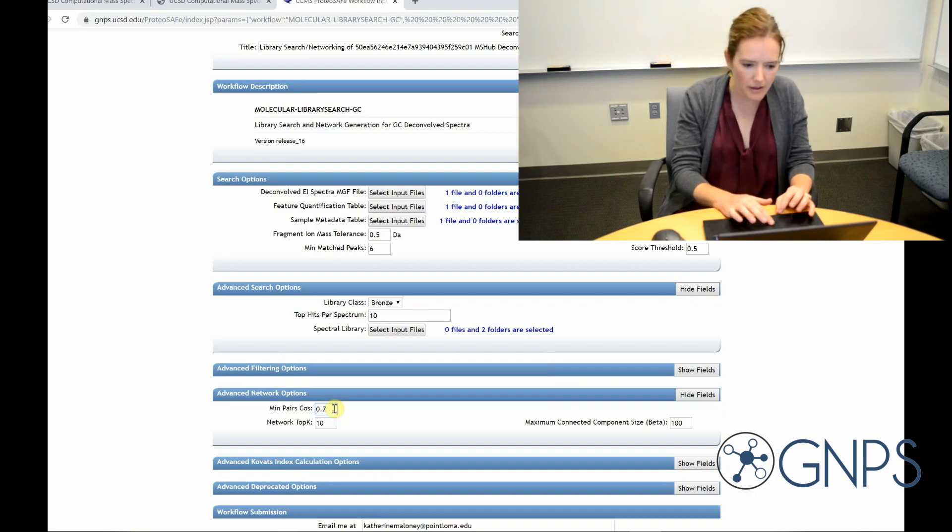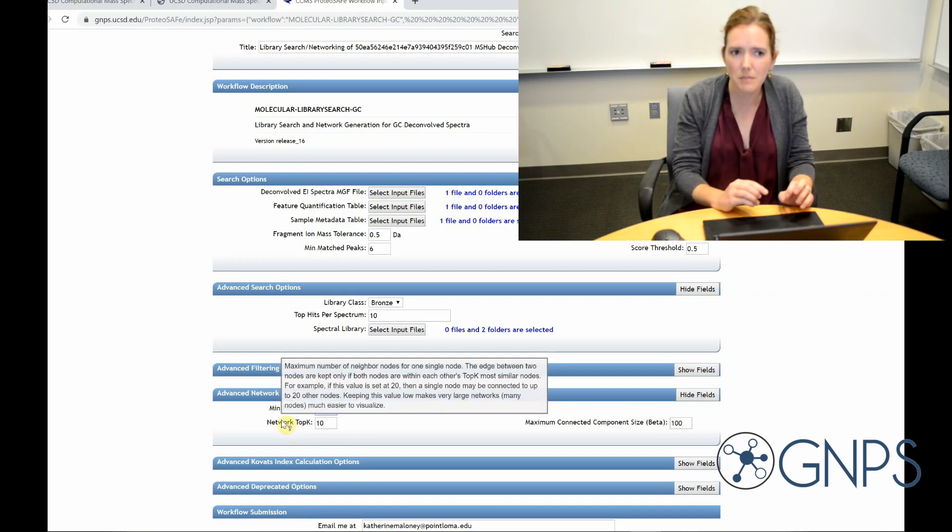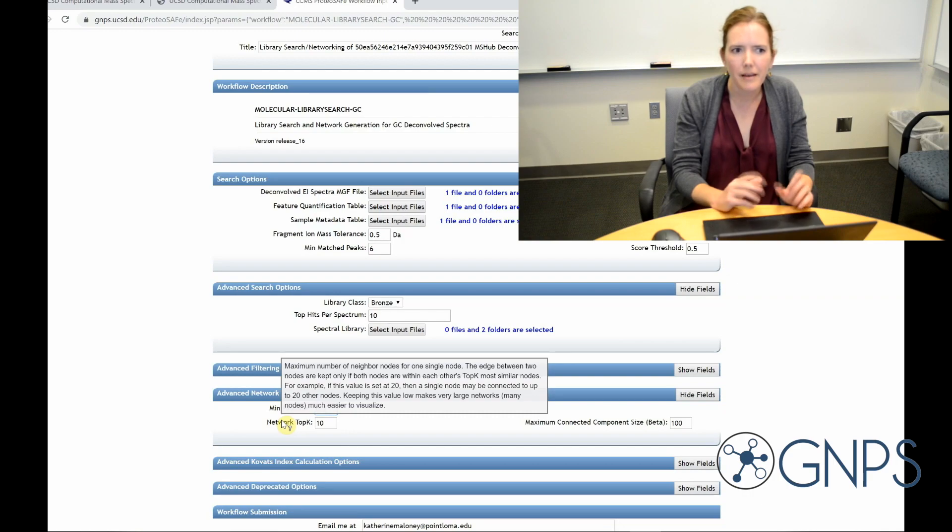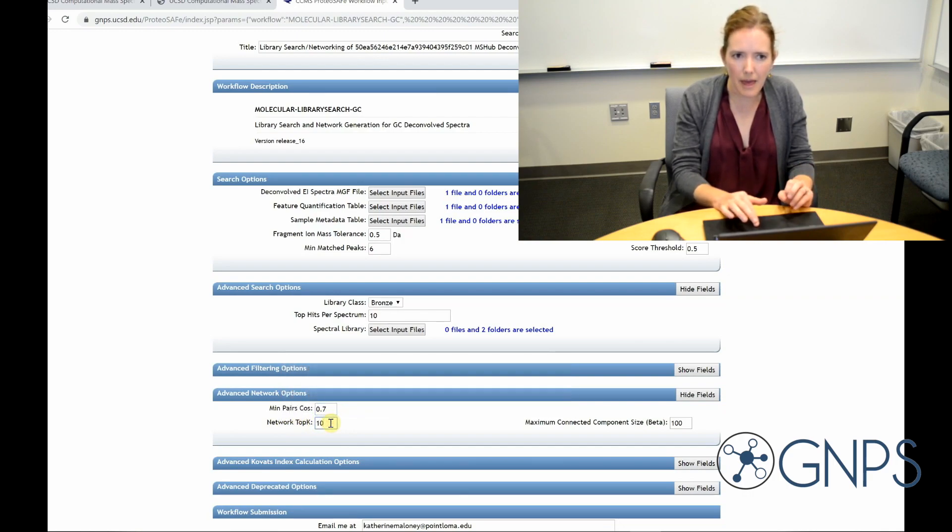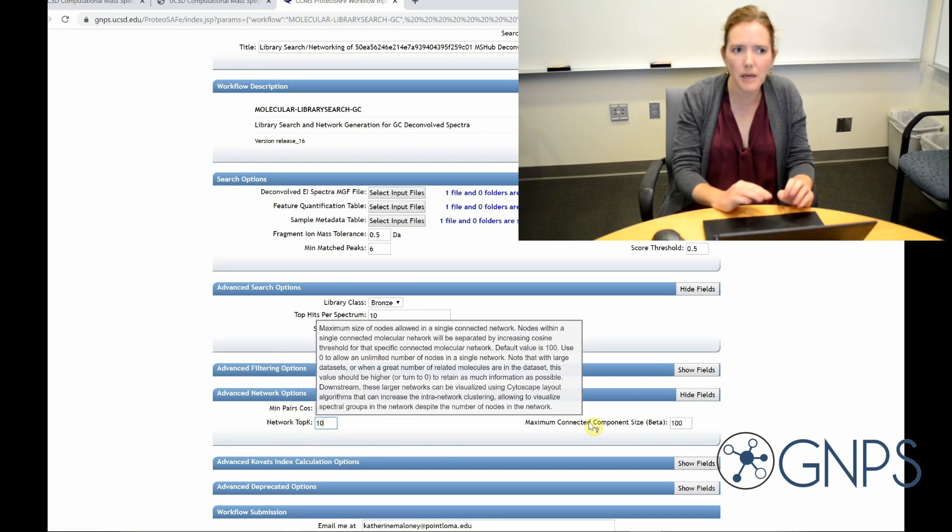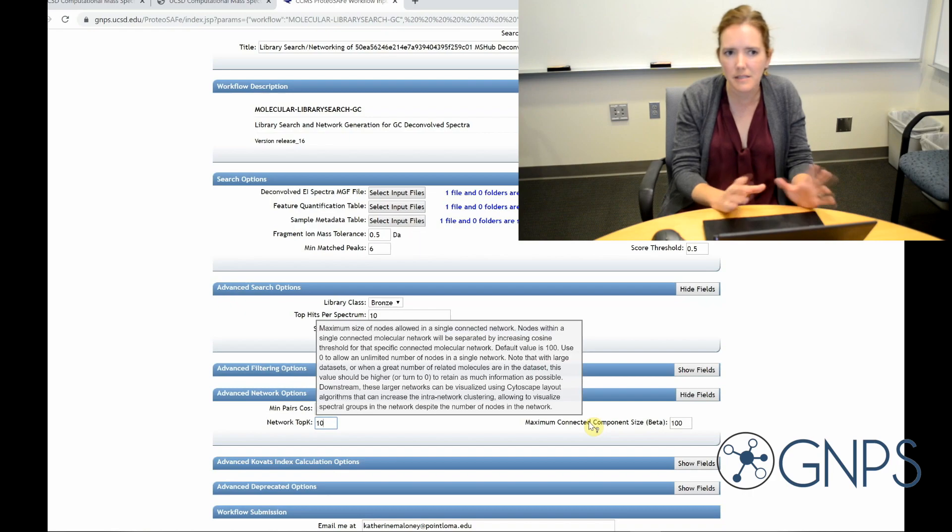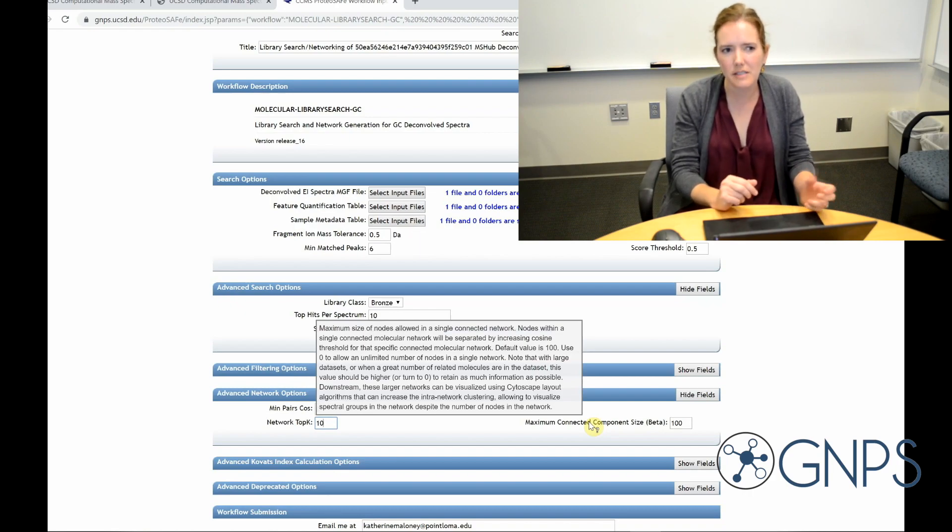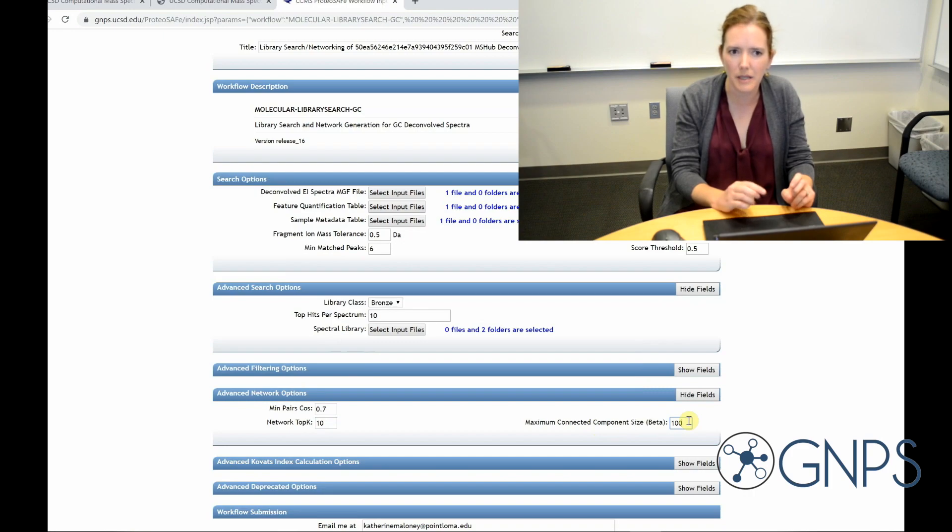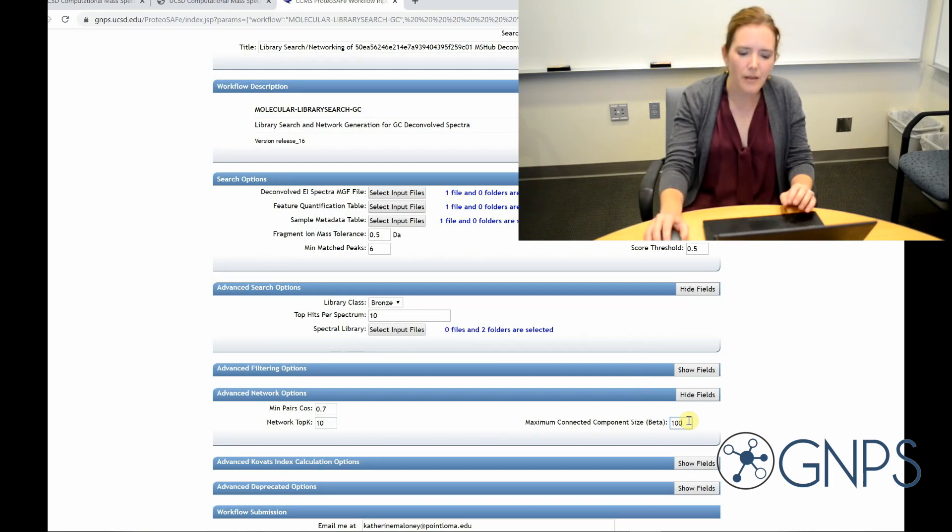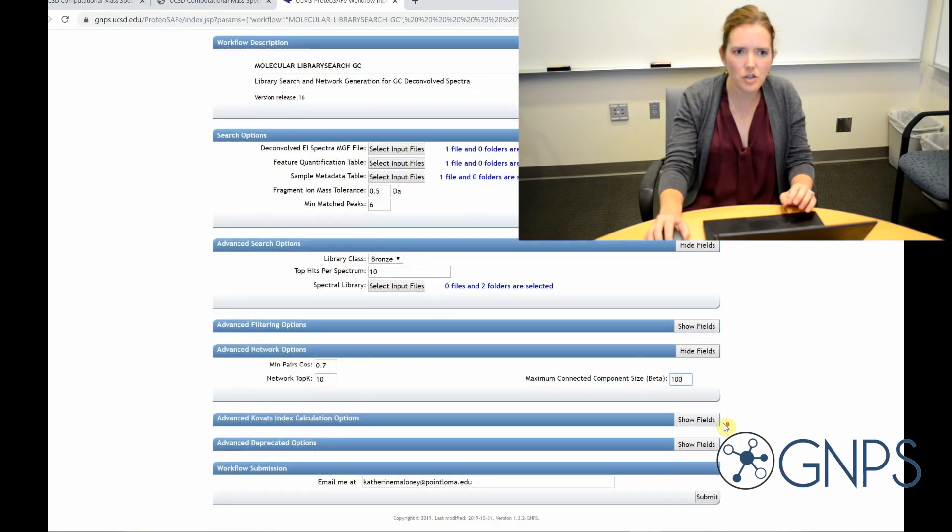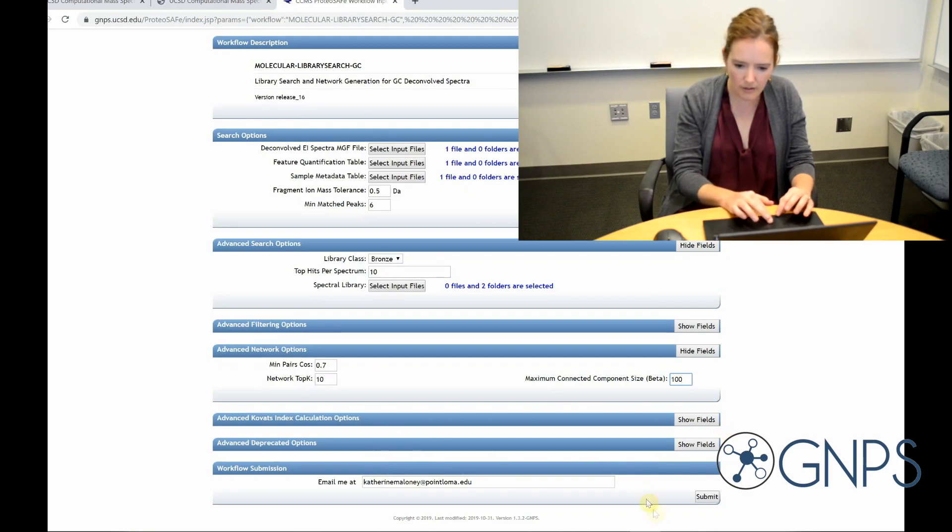Network top K is going to tell us, or is where we're going to set the maximum number of connections that are allowed for a single node. Again, we'll just leave it at the default for now. And then the maximum connected component size is how big you would allow your clusters to get. So if you have too many similar molecules in your data, you can set it at a lower value to kind of break up some of those large hairball clusters. But setting it at zero would just turn that off entirely. There's some additional parameters I could adjust, but I'm going to leave everything on the defaults for now and go ahead and click submit.